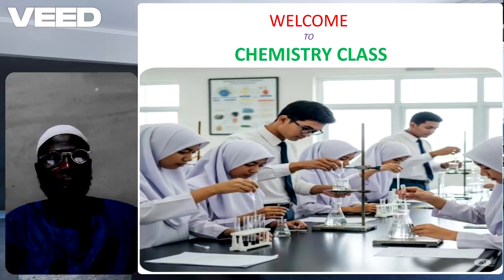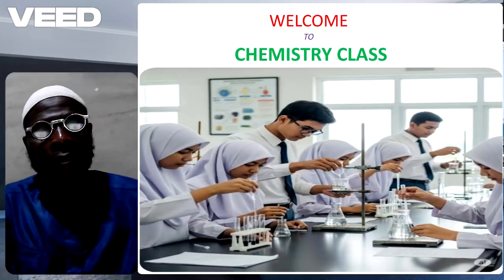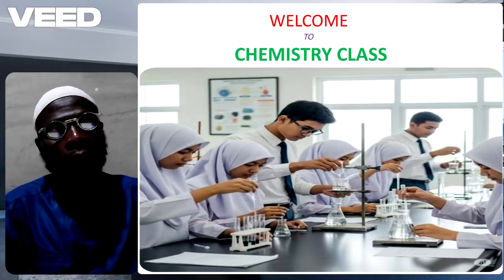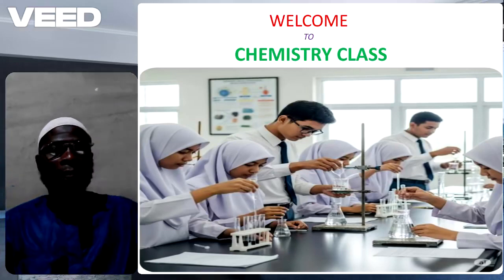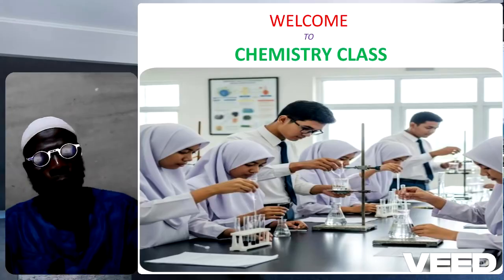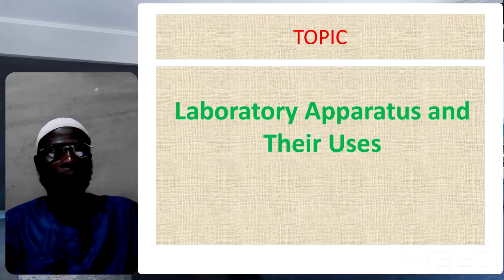So in the last class, we introduced ourselves to chemistry. We defined chemistry, the branches of chemistry, the careers in chemistry, and we also discussed the scientific method of discovery. So today, our topic is laboratory apparatus and their uses.